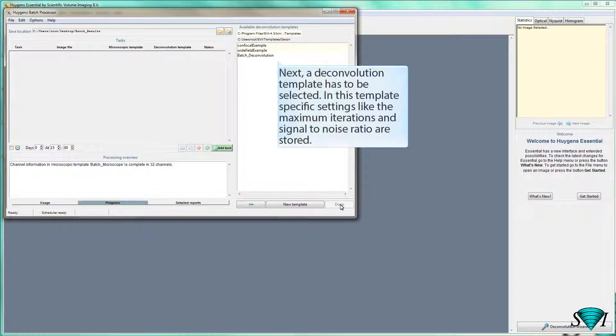Next, a deconvolution template has to be selected. In this template, specific settings like the maximum iterations and signal-to-noise ratio are stored.